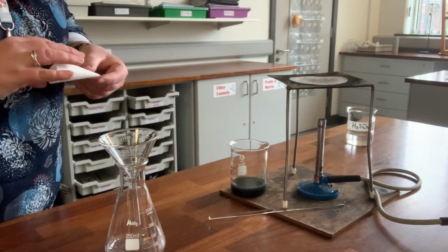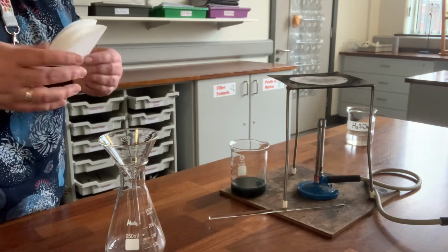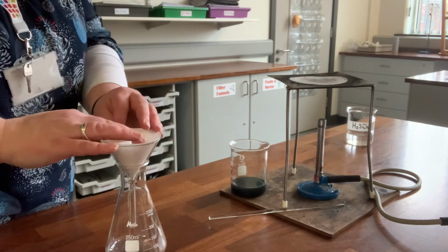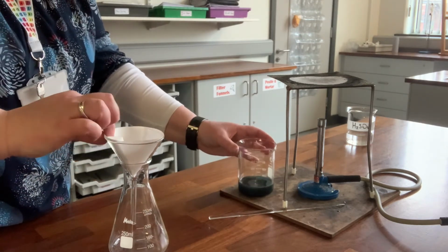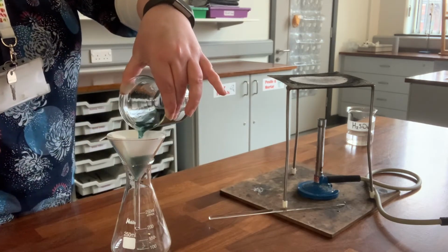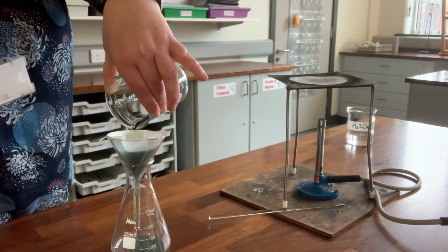And to get that out, we're going to filter the solution. So I fold up the filter paper the way you learnt when you were in year 8 or 9 and put it into the filter funnel, and then we're going to separate it by pouring the mixture through. Hopefully you can see this okay in the video. So hold it through. As I pour it, I can let go of the filter paper, and then what I want you to watch and see is the colour that's coming out.